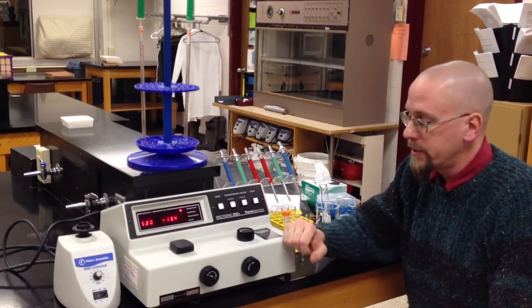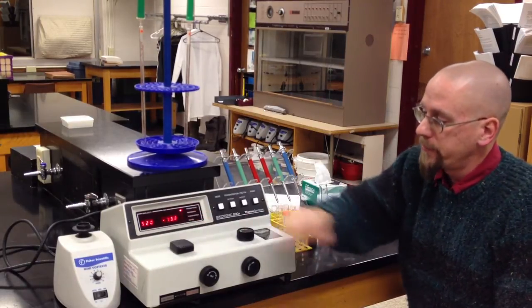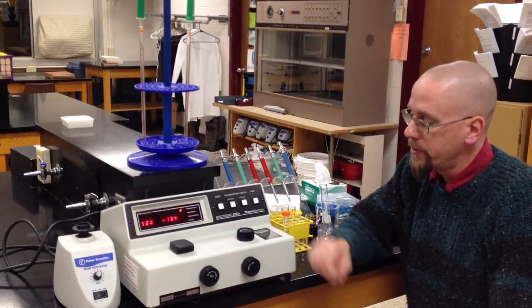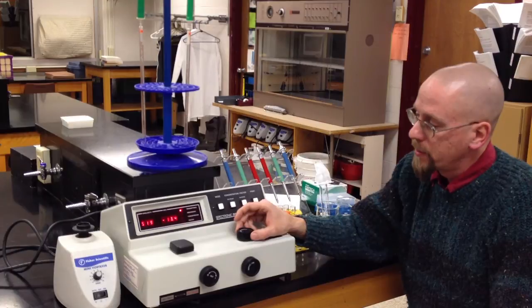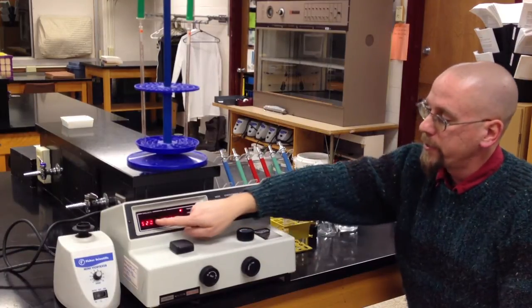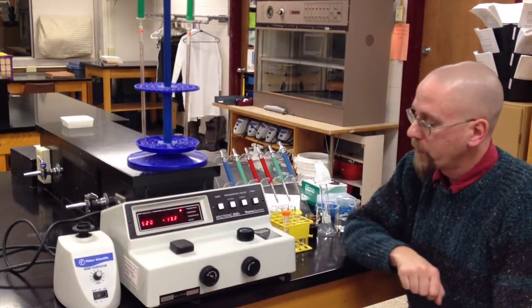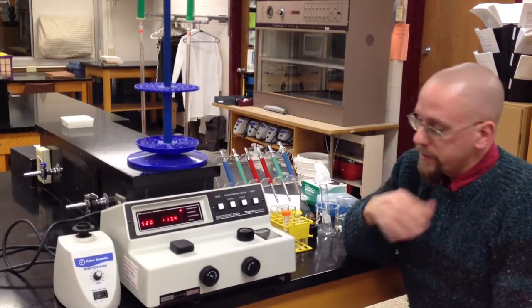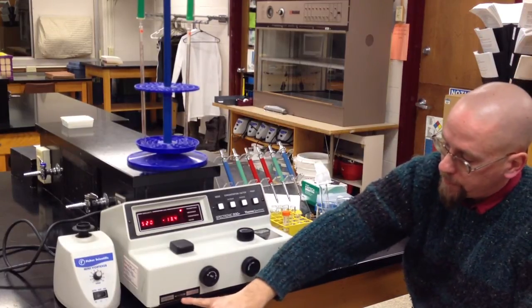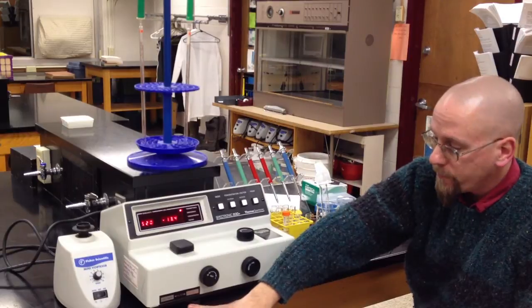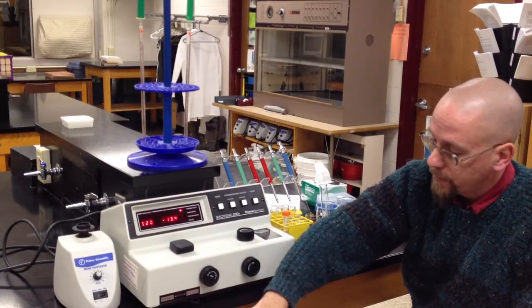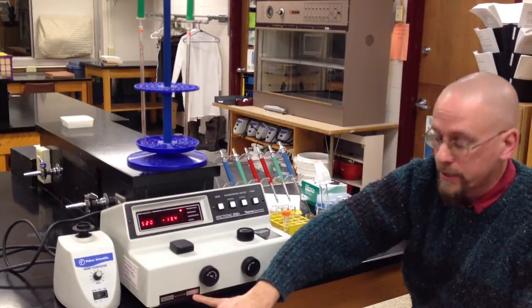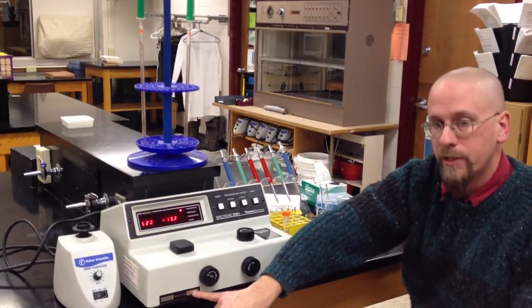What you need to do with these is set the wavelength. Our wavelength for our experiments will be 620 nanometers. You use this dial on the top here to set your wavelength reading at 620. Then make sure down in the front the filter switch is in the 600 to 950 nanometer range.